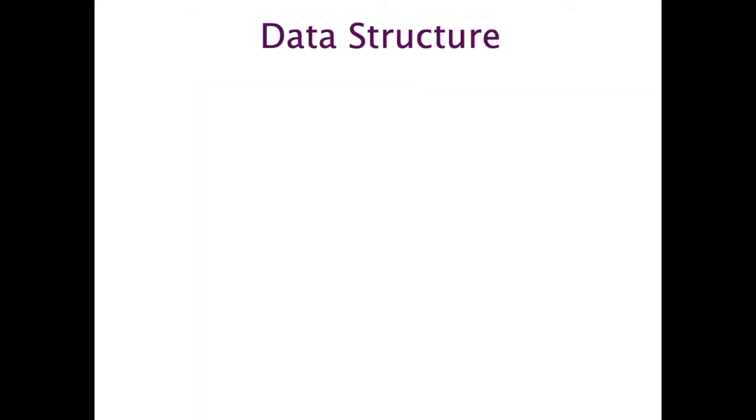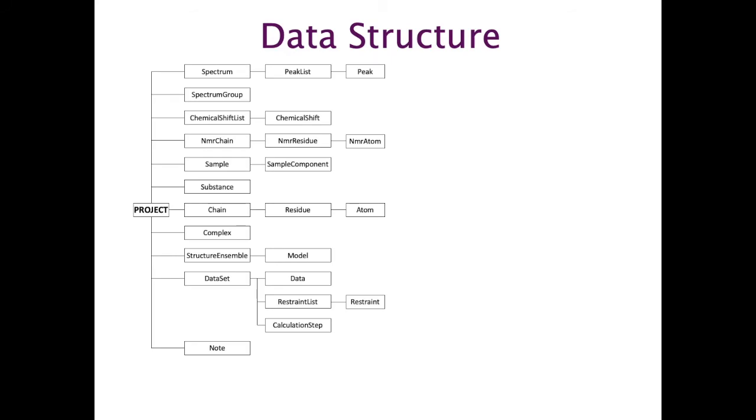Some of you may remember the version 2 data model, which is very complicated. It's detailed and thorough, but getting your head around it is quite difficult. So instead, that data model is still there, but it's rather hidden, and instead we've got a much more simplified data structure. It looks something like this. Just a few main types of data, and then a few bits that are nested.